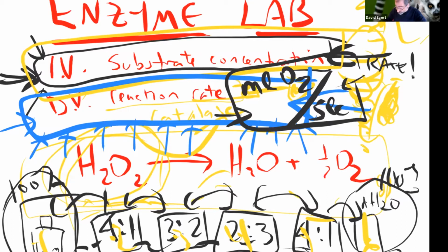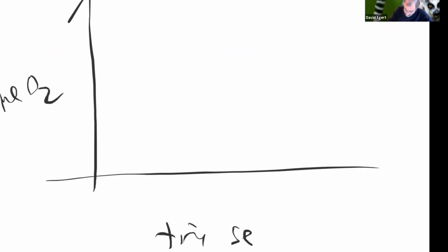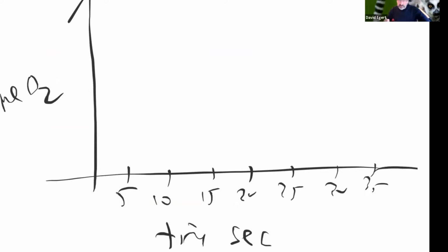So, in fact, I can give you a quick little peek ahead. Basic idea is you're going to have this reaction going in a little flask.